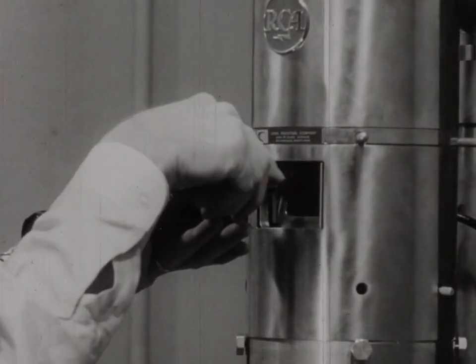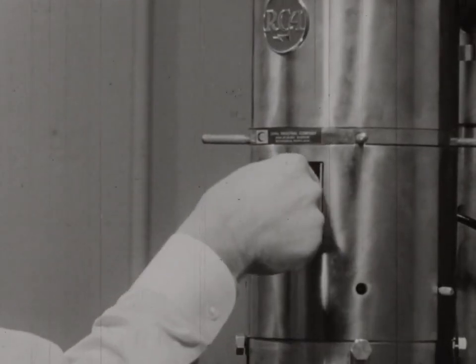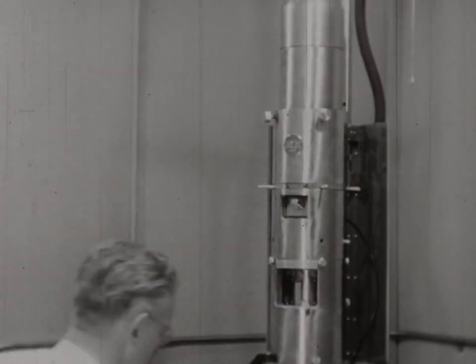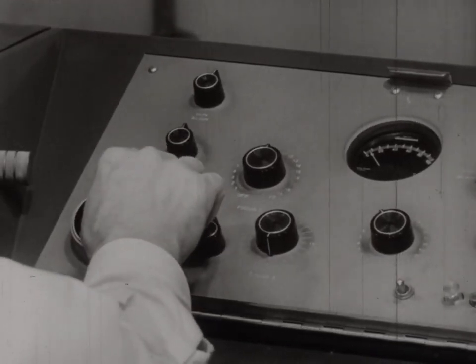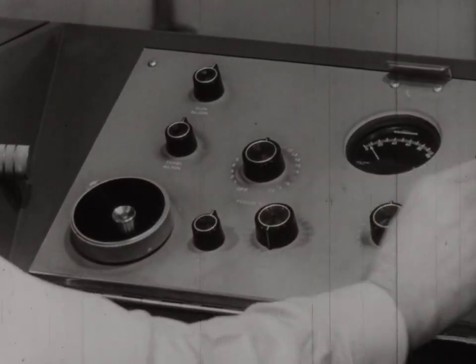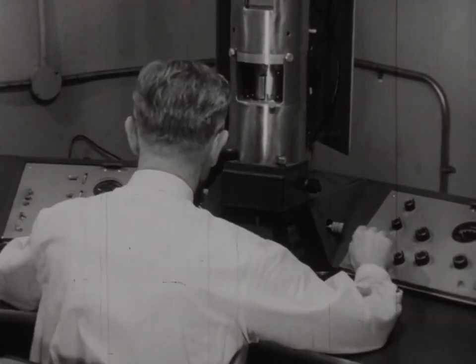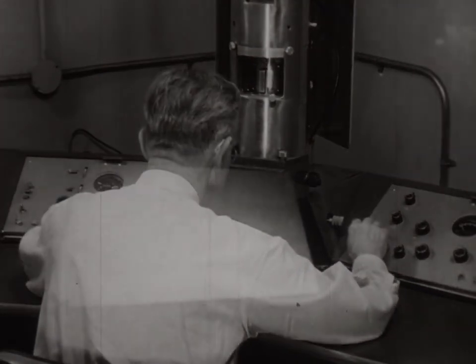Remember now, the electron microscope can magnify as much as 300,000 times. So we have to be quite precise in the handling of the instrument. We then close up the door of the instrument, pull a vacuum, then turn on the juice, and we're ready to take a look at whatever we have there. Now we can actually see what these virus particles look like.